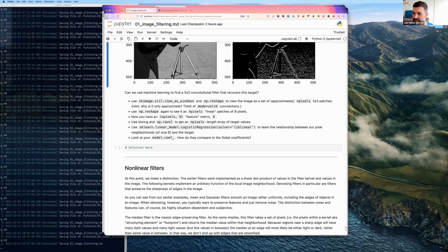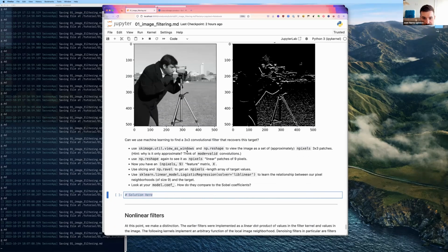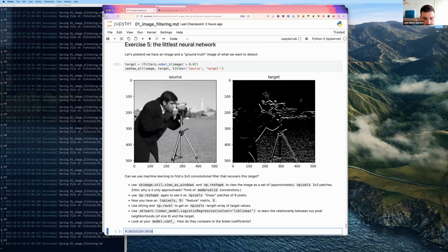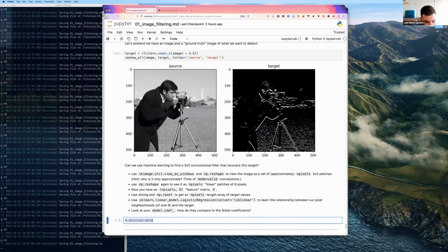And scikit-image has a really cute function to do that, which is called view_as_windows. Okay, so we're going to do that. Do I pad? I'm not going to pad. Okay, so one of the things is, what's the best way to do this? Maybe I don't need to pad. I've always taken the middle, but let me see what the target is. Oh, that's right. Sorry. I know.